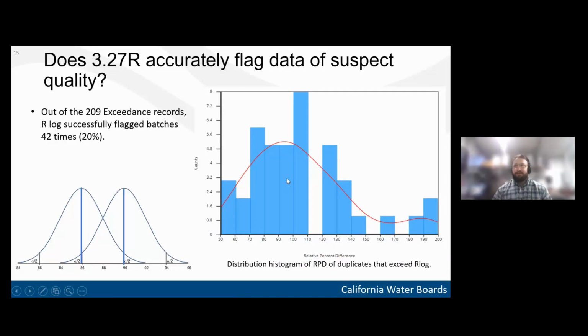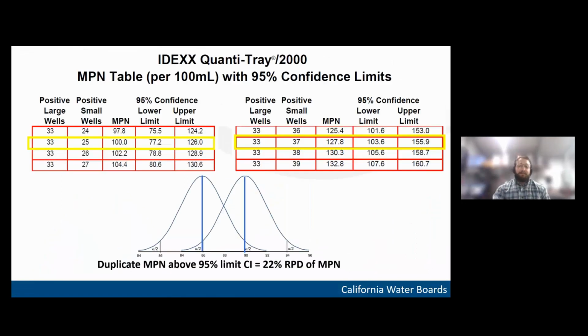Again, when you're talking to the public, or if you are going to be shutting down a beach based on a value, you want to be able to say yes, if someone asks you if you can repeat that measure on the same value. If you get something completely out of the confidence interval, I think that leaves us open for legal interpretation. So this is the metric that we've gone with. I have a narrative written for this, along with the rest of the data analysis, if you'd like to see it. But again, this is what we'll be moving forward with as of this month.